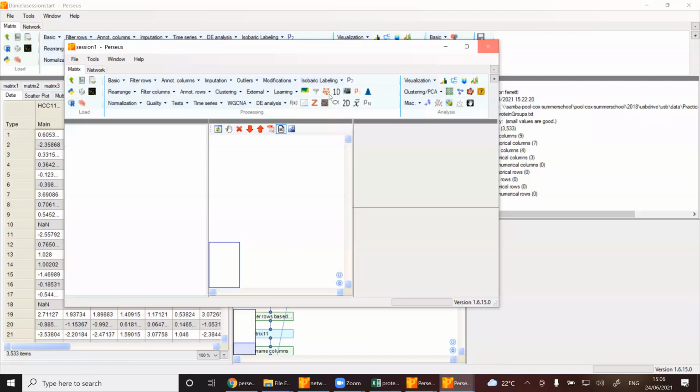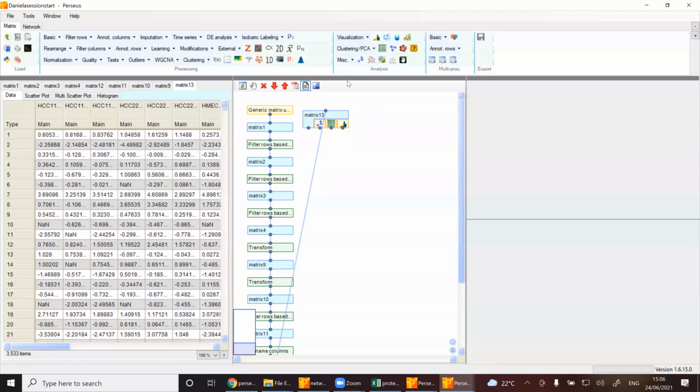Now, maybe before continuing to the analysis with the SILAC dataset, we can reply to some questions because we saw that we have many of them. One, for example, is about the reference channels in TMT. This attendee asked about it: they say that their dataset has a reference channel, which is the mix of the samples, and when they applied the normalization that was explained last Tuesday, they don't see any difference.